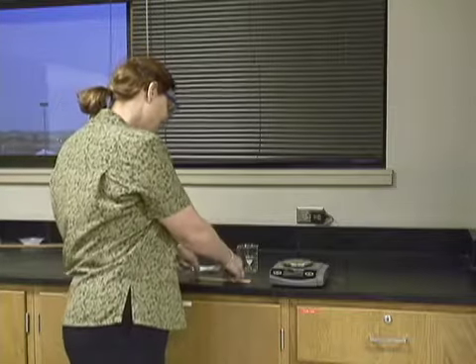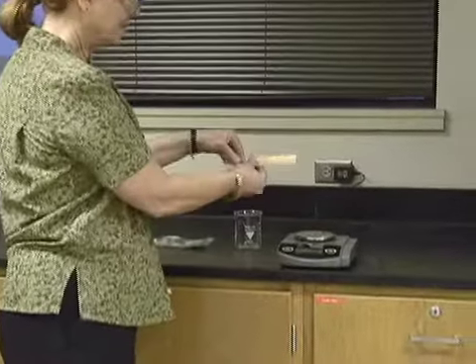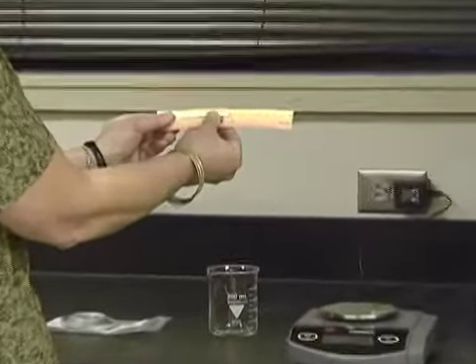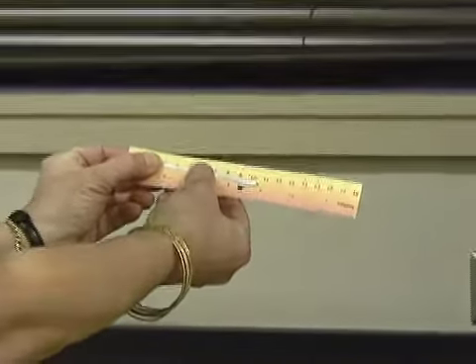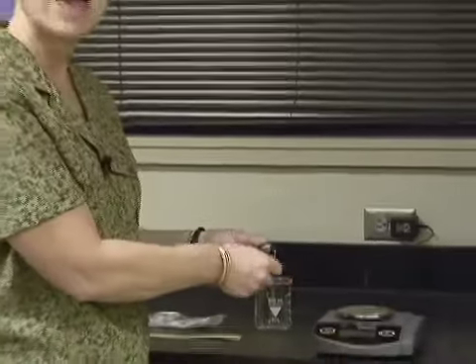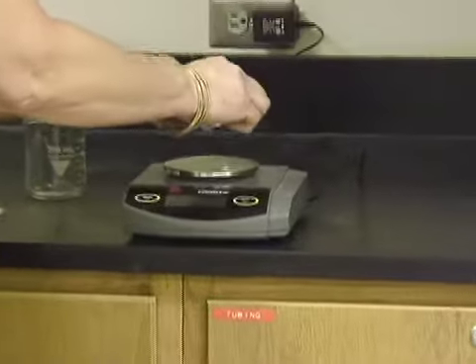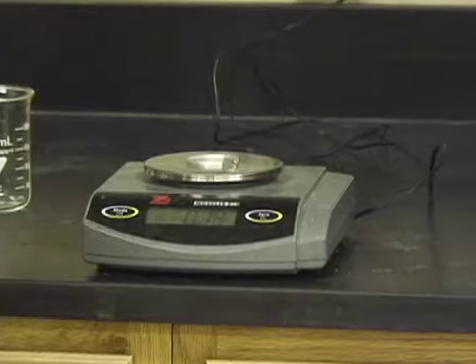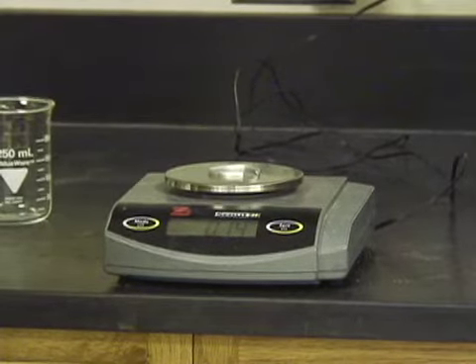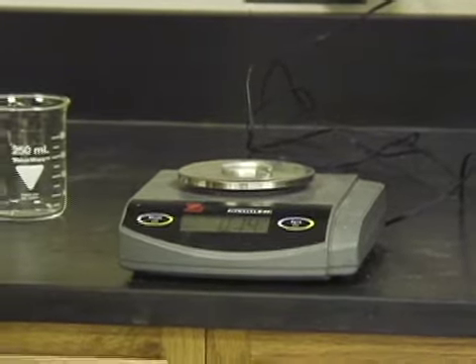Here we are again in the lab. I'm so excited. I have some magnesium ribbon here, and I'm going to measure out 10 centimeters of the magnesium ribbon right here, 10 centimeters. It's a little bit longer than 10 centimeters, but that's okay. We can do that. And then I'm going to get its mass. And it's very soft, so I'll just put it there in the middle of the pan, and its mass is 0.14 grams. 0.14 grams is the mass of my magnesium.